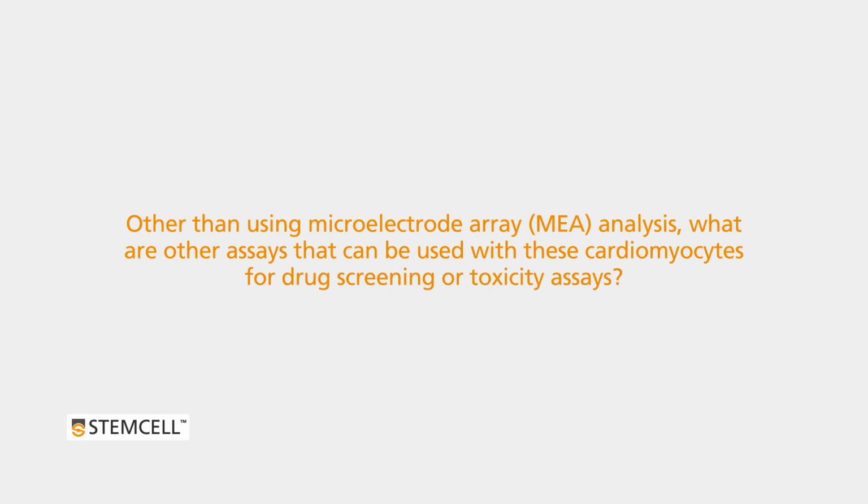Our cardiomyocytes, we don't show it at this talk because of time, are adaptable to single cell phenotyping so that you could generate the cardiomyocytes as we showed using the STEMdiff cardiomyocyte dissociation kit, and generate single cells. You can use a more dilute volume of cells and replate them down to do single cell work. So those are your other options in addition to the MEA.